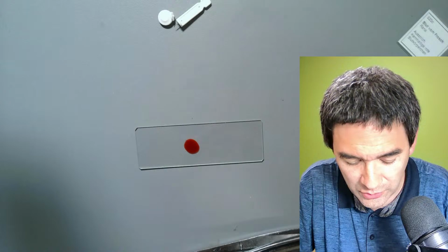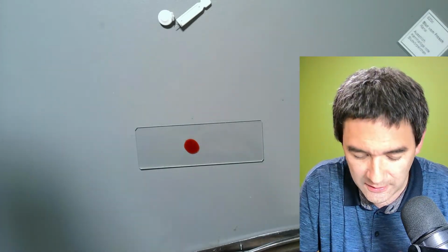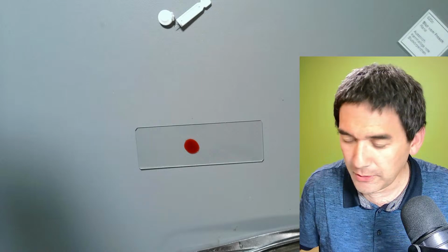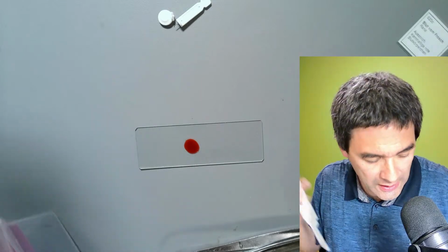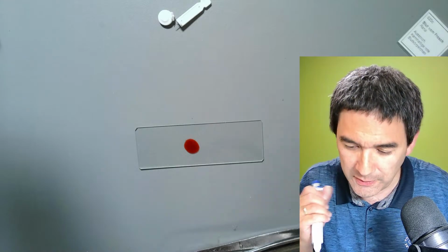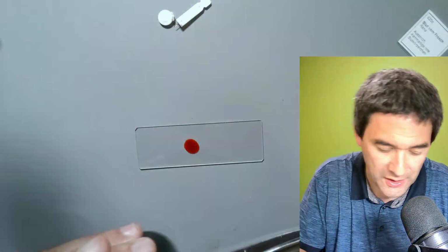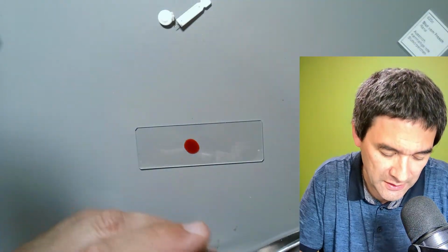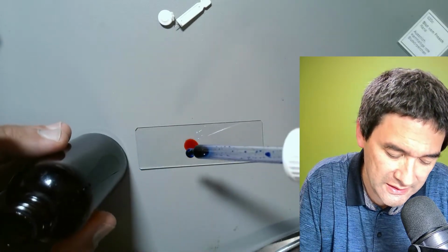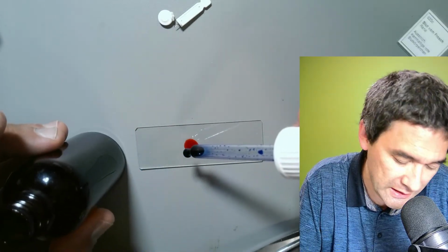And I would like to now do the following. I would now like to do a methylene blue stain. And I do that by simply adding a little bit of so-called Löffler's solution. I know that for staining blood there are other stains that are more commonly used, but I was quite successful with this one. So I'm just going to stick to it. This is methylene blue, and methylene blue is able to stain DNA. Okay, so I'm going to add a drop of this here.